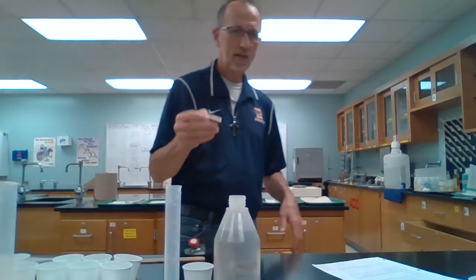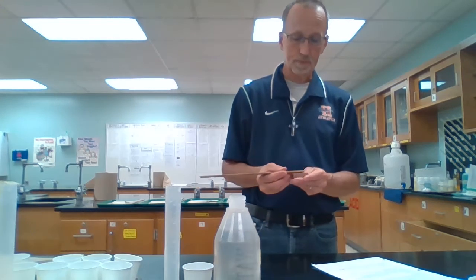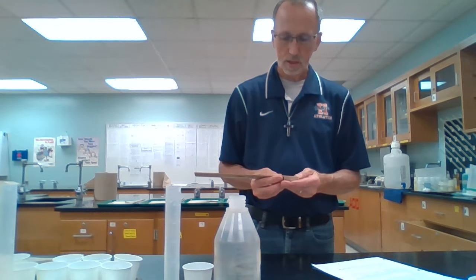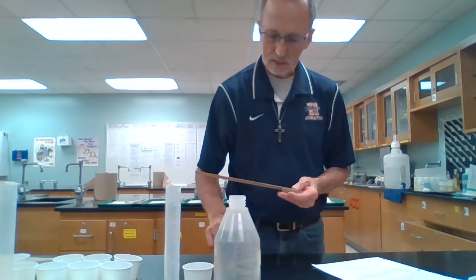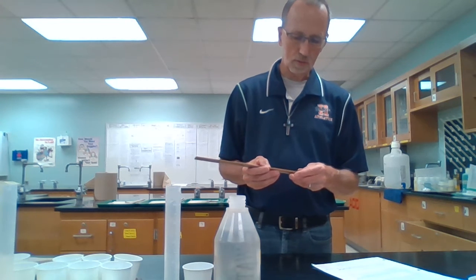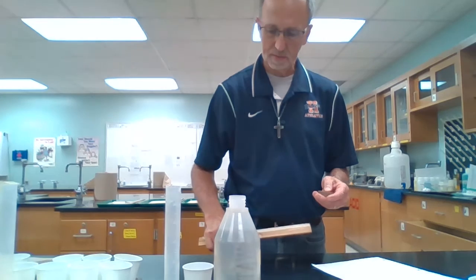Okay. Number 5 is a rectangular solid, so we can find its volume directly by measurement. Looks like about 4.30 on the long side, and about 1.20, 1.15, somewhere in there.